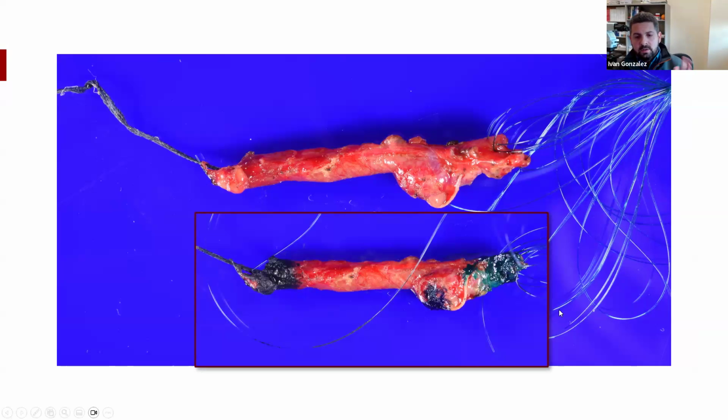So how to submit those sections? My recommendation would be that your first section, your A1 or B1, be a shave section of the fibrous plate. And then you sequentially submit from proximal to distal, considering proximal the fibrous plate, all the way roughly to where the common bile duct starts. And then at that point you switch direction and submit again, proximal to distal, your entire common bile duct, and then proximal to distal your gallbladder. So yes, we're submitting the entire specimen. That roughly ends up being 8 or 9 cassettes, because you can put multiple pieces in the same cassette, and those tend to be small.